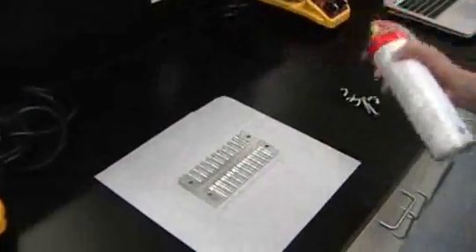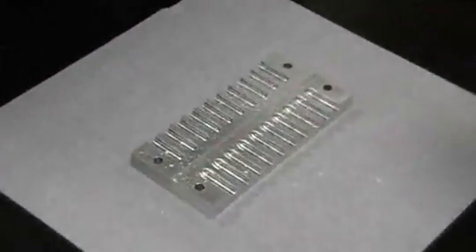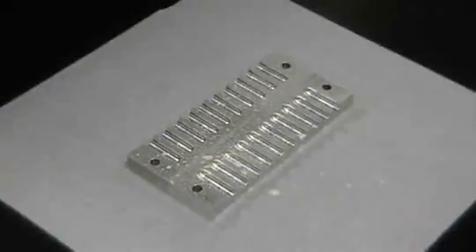Take your metal mold and take cooking spray and spray a little bit on top of your metal mold. This way you're going to be able to pop your cold suppositories out of its mold.